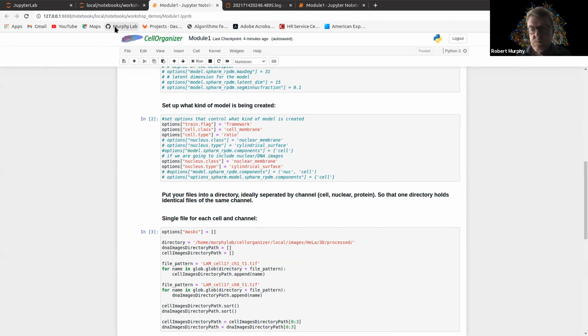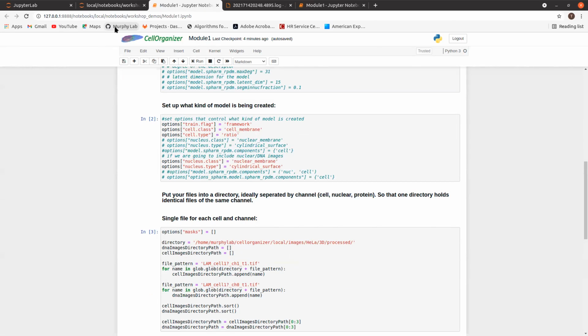I was able to get things from the Google Doc, where you get chmod, Docker run on Mac OS, with removing, and it tells you the container size. Then I killed the command with Control C. But how do we get to running the actual Docker, running the actual CellOrganizer within, let's say, the terminal?